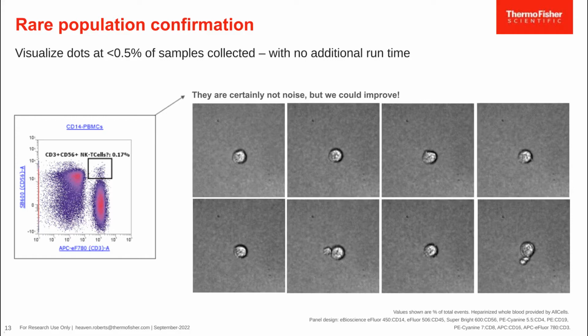They certainly are not electronic noise. And I will say that after looking at millions of images, I can tell you these look like NK-like T cells. This is the expected morphology. But you can see that a couple of them, one has a spent platelet. We have an example here of one that has these two small apobodies. Again, this might have been picked up from another cell.